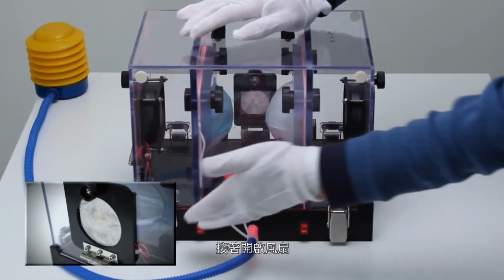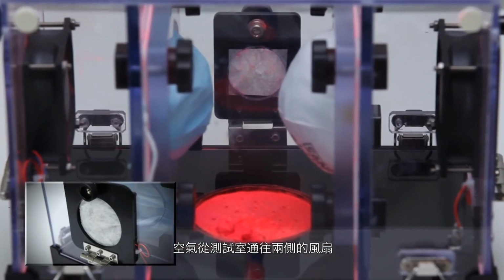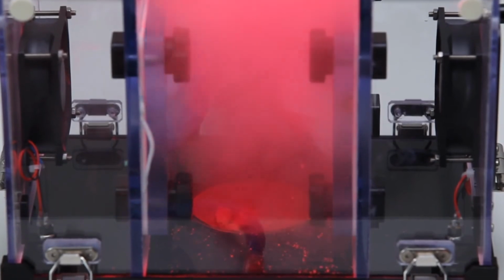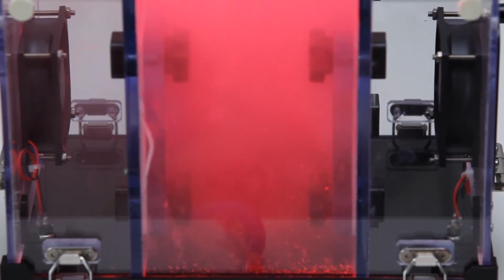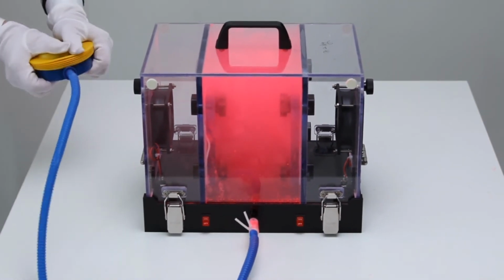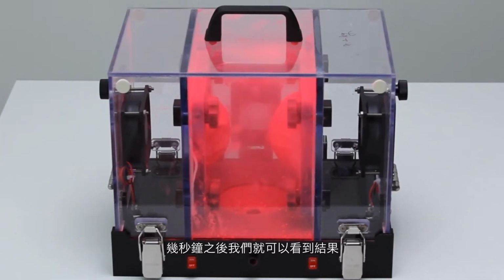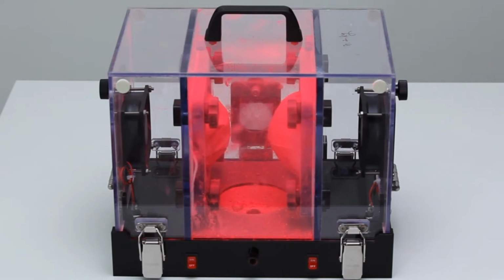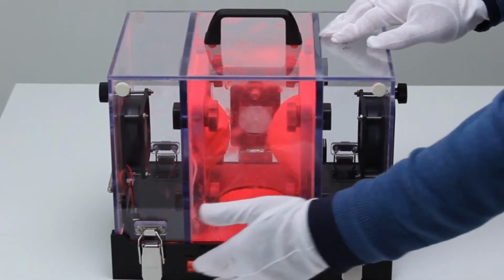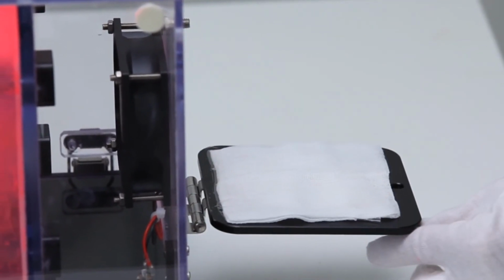Then turn on the fans. The air is moving from the chamber through the fans at both sides. As the air is pumped into the box, the pink particles will soar up and fill the mid-chamber. After a few seconds, we can find the results. Then, we take out the plate from the fan.